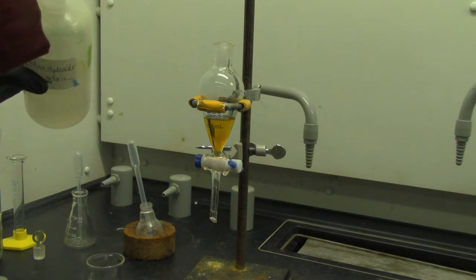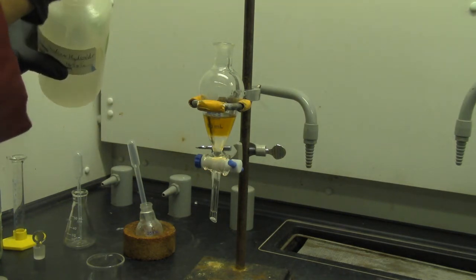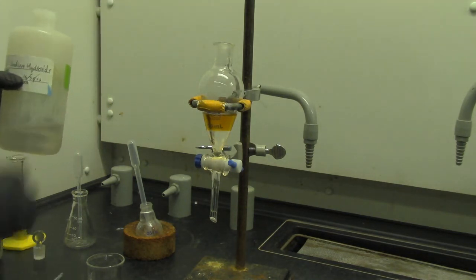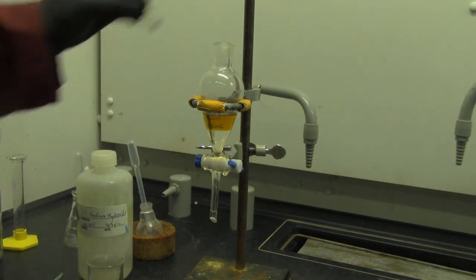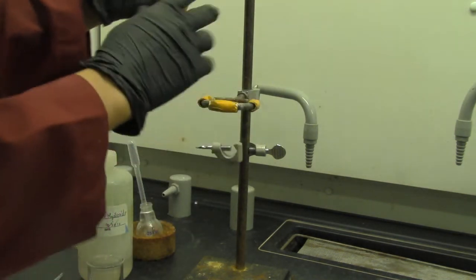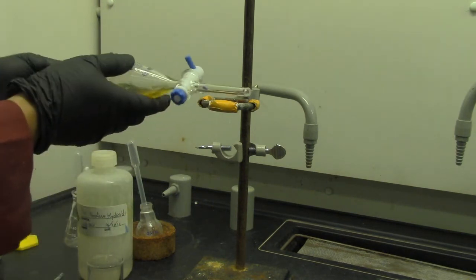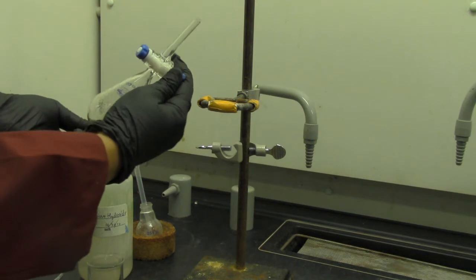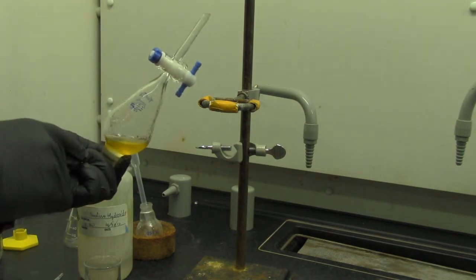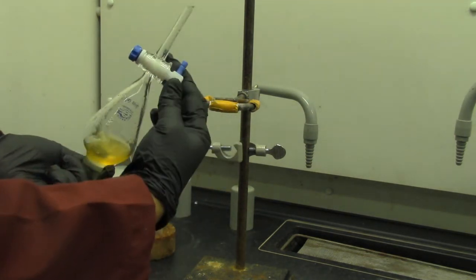So this is 2 ml. This is another 2 ml. So that gives me 4 ml of 5% sodium hydroxide. And cap it and shake it. So closed, and all you have to do is shake it. It's creating pressure, so you release it from the bottom while you're shaking it. Make sure you hold the top, put it upside down, hold it with your thumb or your palm really tight, and you vent it from the bottom, okay?